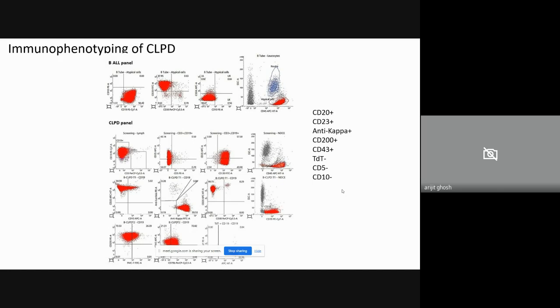And in a cell image you can only see a specific phase, with only 100 cells, but in flow cytometry you can analyze 10,000, 20,000, or even 1 lakh of cells. That is why nowadays flow cytometry is a very preferable technique to researchers and to doctors for diagnosis purposes.